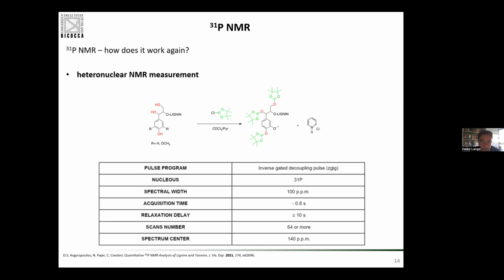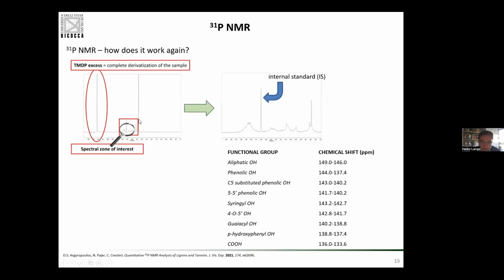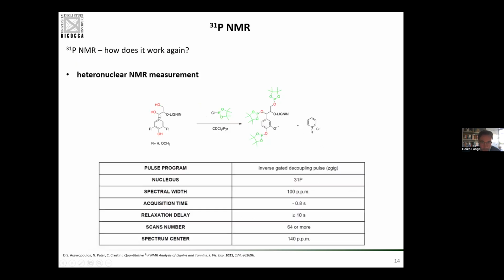On the very right here, I should see another huge peak, and this huge peak is the peak that comes from the reaction of my reagent with water. So it's another control peak, because I know my lignin is dried, but I didn't dry out the last drop of water. I have some water molecules inside my structure, right? It's not wet, my lignin, but it has been dried to constant weight. The water that stays in at this constant weight is structural water.